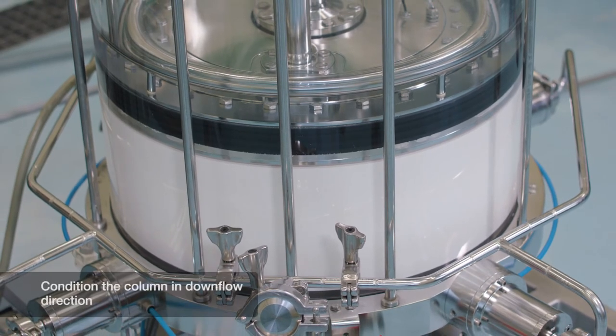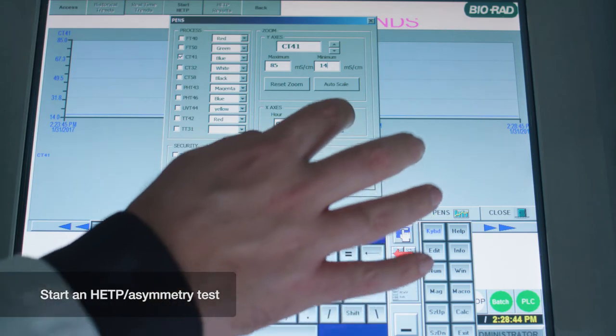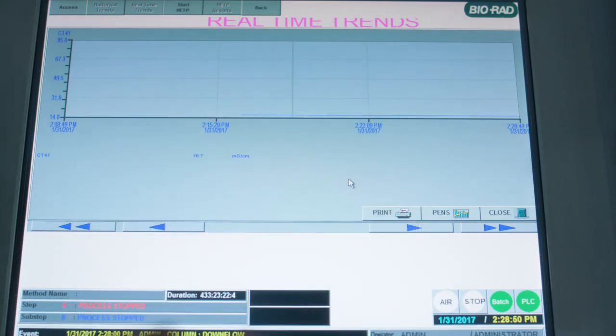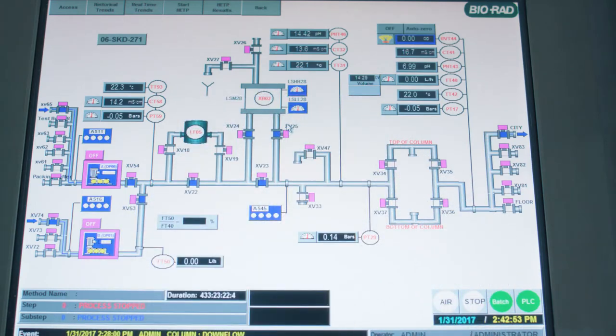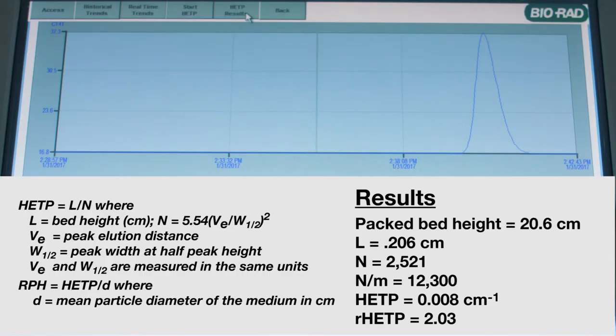Condition the column with 3 to 5 column volumes of running buffer at 100 centimeters per hour or selected operating flow rate. Start an HETP asymmetry test. This test indicates the efficiency and integrity of the packed bed. Be sure to use an appropriate HETP test running buffer, and equilibrate the column with 3 to 5 column volumes of test buffer using flow rates of 75 to 150 centimeters per hour. The injection buffer is the test running buffer adjusted to a total sodium chloride concentration of 1 molar.